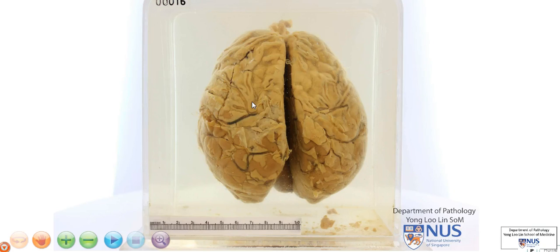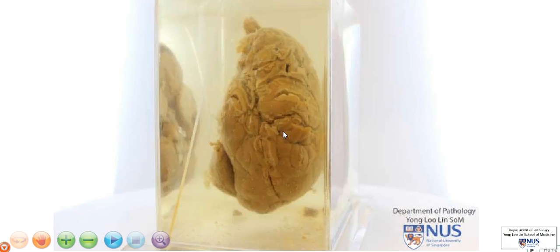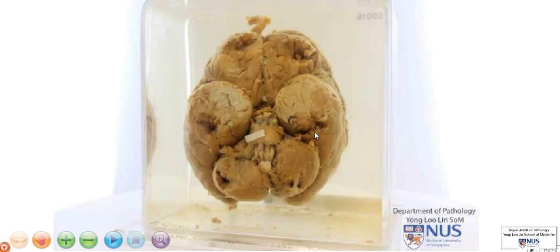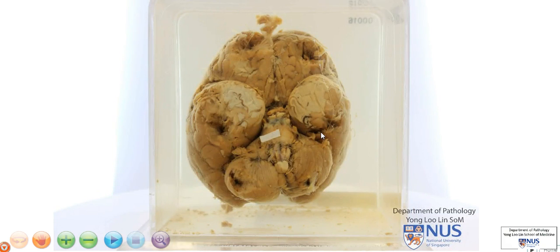Hello, we're looking at the specimen of a brain here. These are the cerebral hemispheres, and we're looking at it from the top. And as I turn it around, you can see the side view, and here we're looking at it from the bottom.